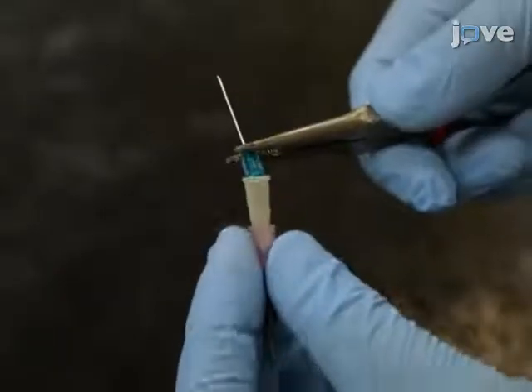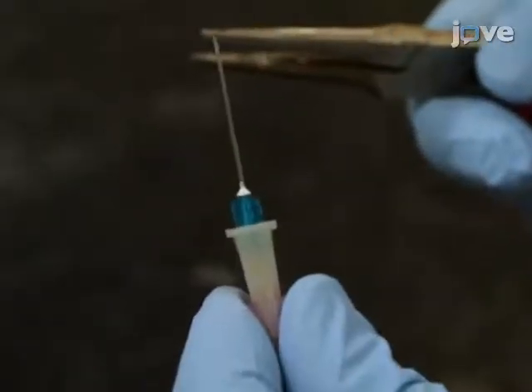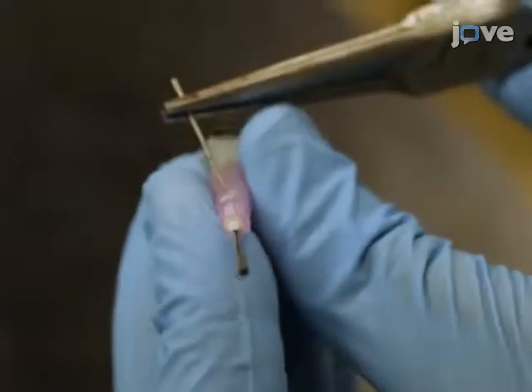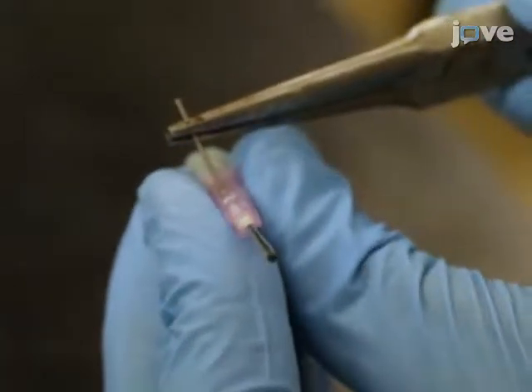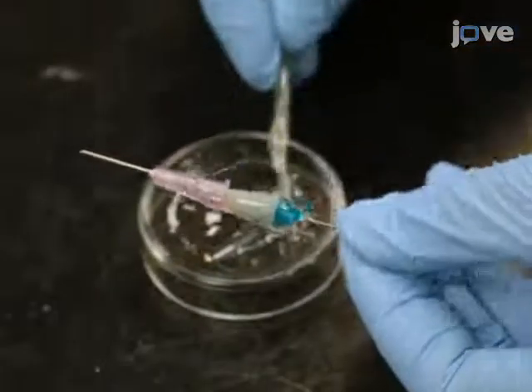After that, insert a 23-gauge needle in the barrel of the central needle in the reverse direction. Make a hole on the side of the barrel of the outer needle and insert a matching size metal connector. Seal with epoxy glue.